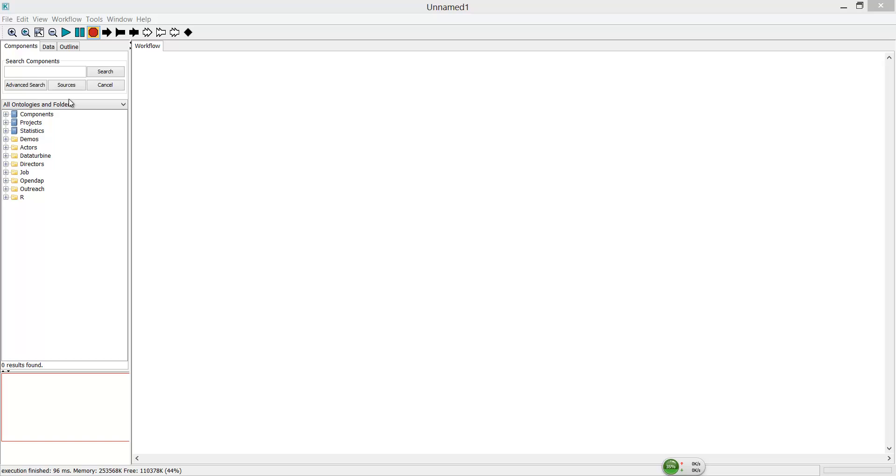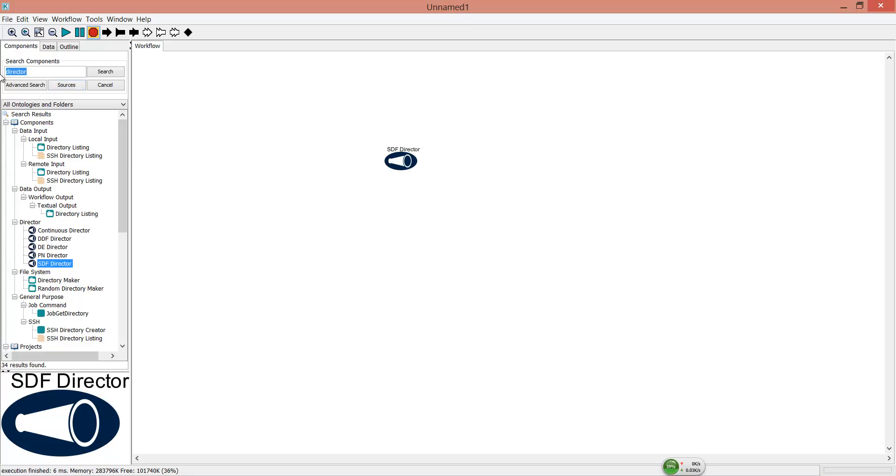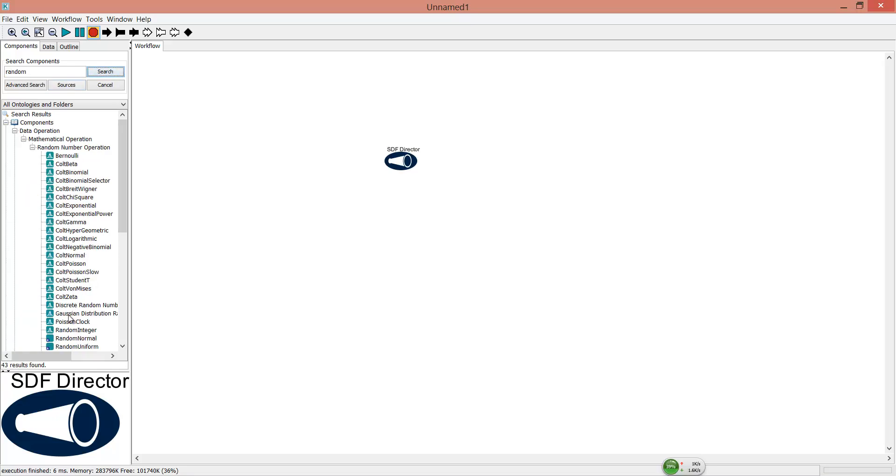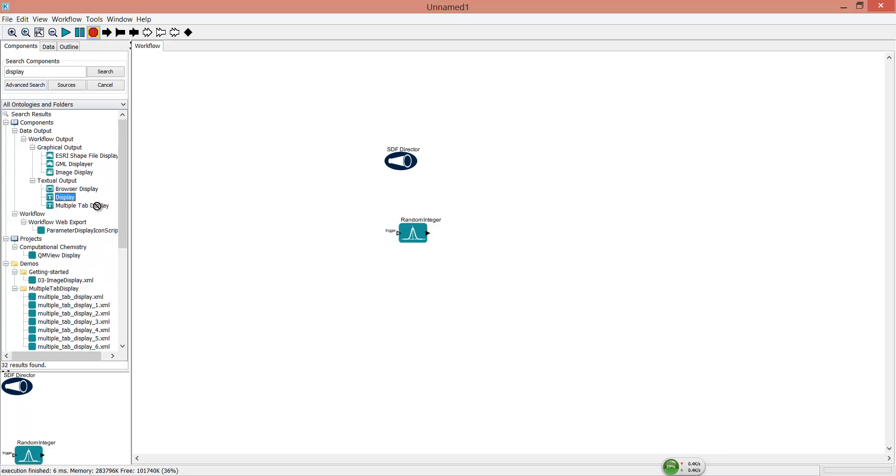You need a director as the runtime engine and the actors to generate and display the random integer. Relation for data delivery. Click Run button.